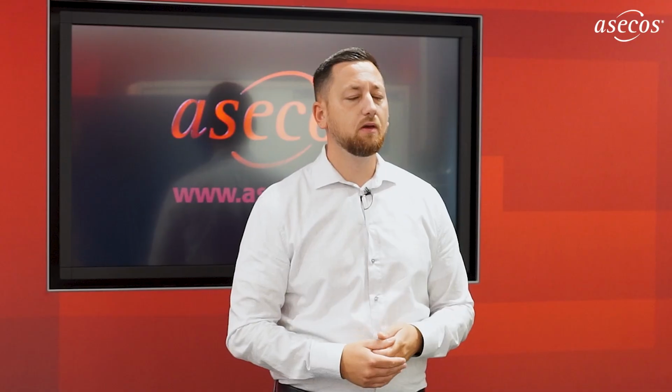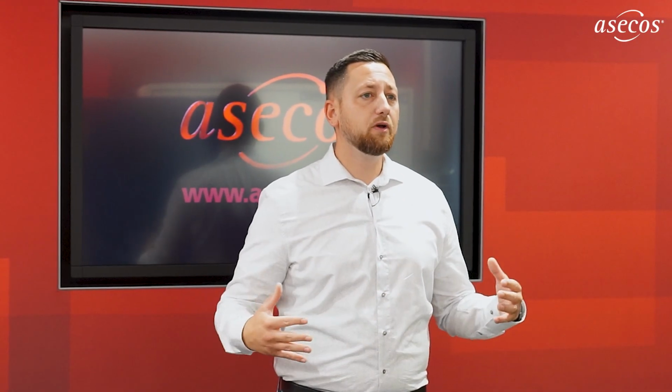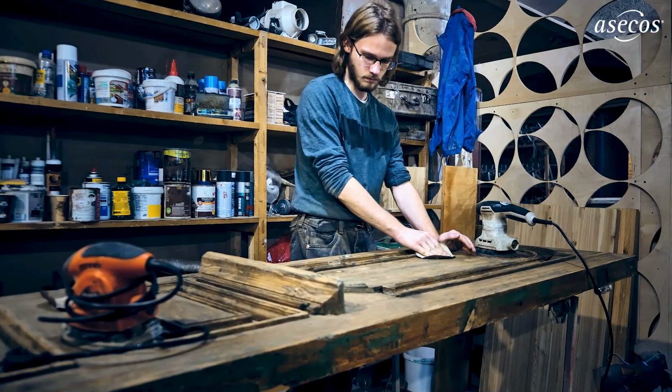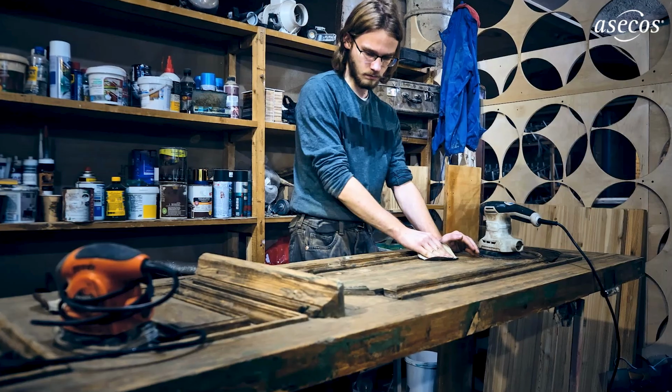Wherever hazardous substances are stored, they are normally also processed in some way. So, the question is, how do you process hazardous substances in your day-to-day work? The three most common methods of handling hazardous substances that we know from practice are: 1. Unprotected work on workbenches or laboratory tables. In the best-case scenario, personal protective equipment such as gloves and good ventilation are used. This is inadequate for day-to-day work with hazardous substances and does not comply with current occupational safety standards.